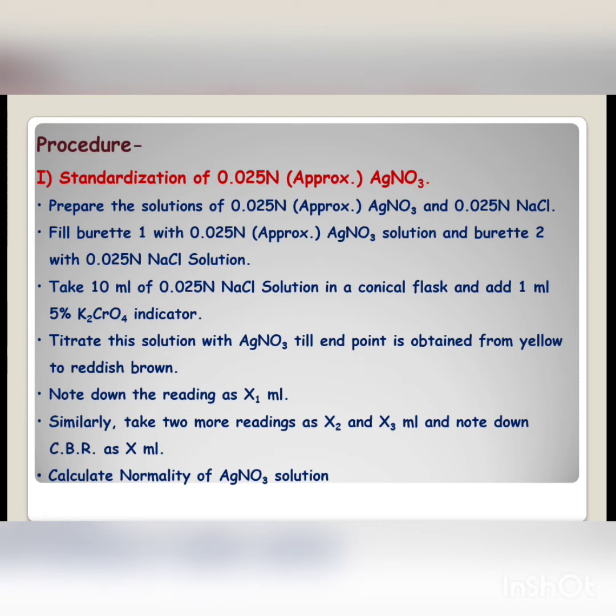by cross multiplication. And we will do similar calculations for NaCl also, but here we will take the weight 58.44, which is the equivalent weight of NaCl.